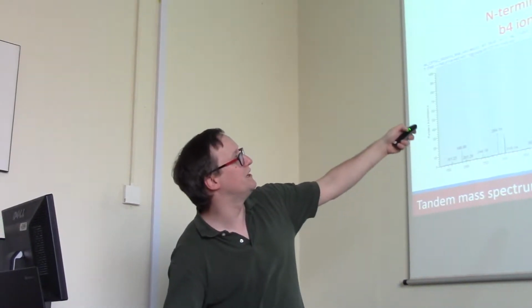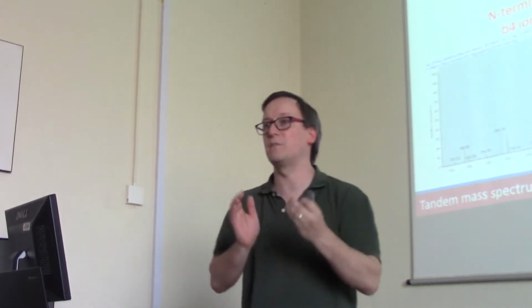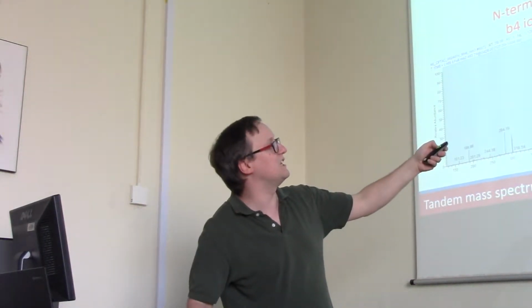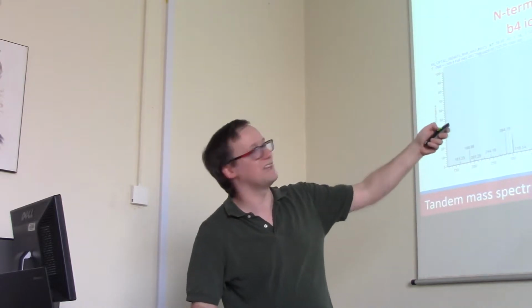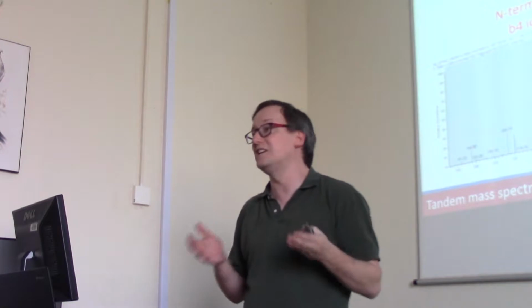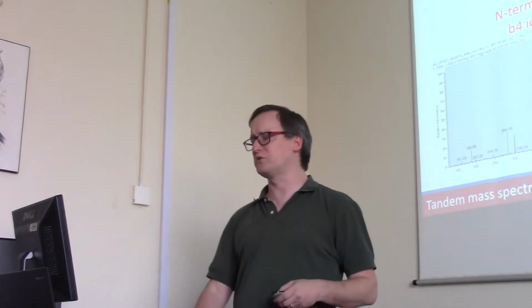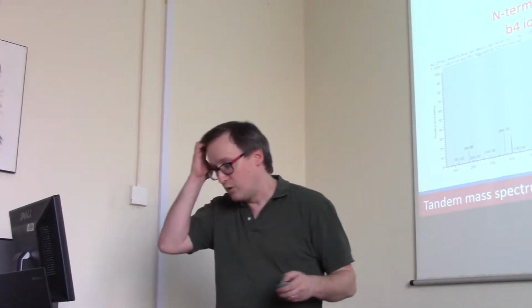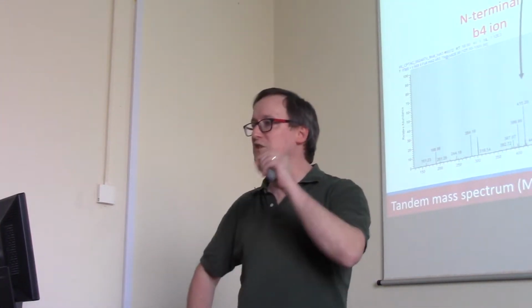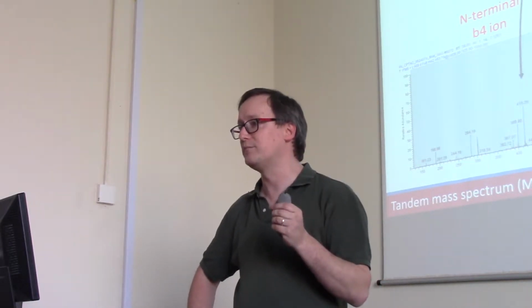Right now, we could say that we have these 6 amino acids all in one fragment ion containing the C-terminus of the peptide, and it carries the name Y6 because it has those 6 amino acids in it. Where did A and C and X and Z go? There's a story behind it, but I won't get into it. Blame Roepstorff and Fohlman. So, we now have these fragments, and the fragments we observe are indicative of the sequence.